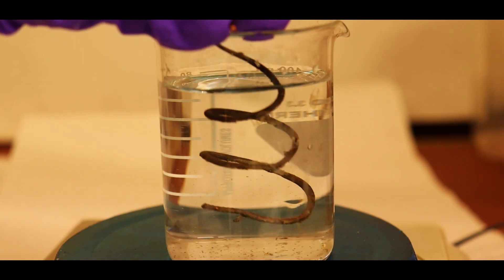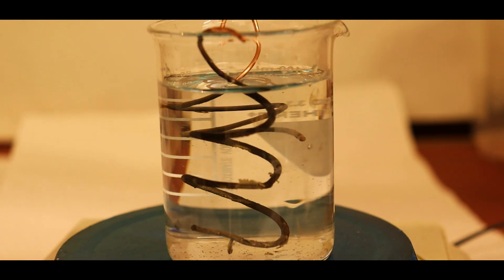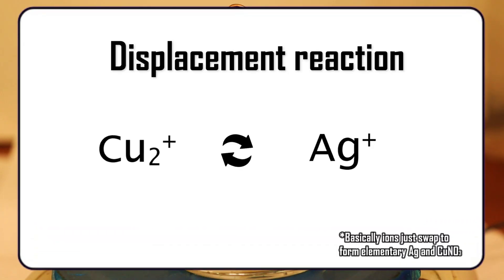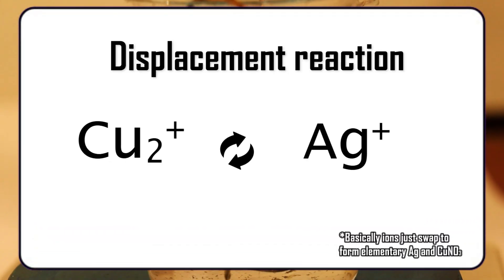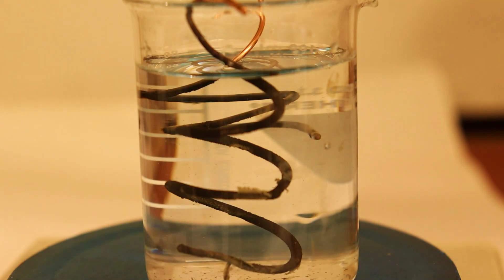Next, an interesting experiment is adding a copper wire in the silver nitrate solution. Ions undergo a displacement reaction, which ends up depositing elemental silver on the wire's surface, with crystals of silver growing larger and larger over time, resulting in the formation of a structure that kind of resembles a tree.